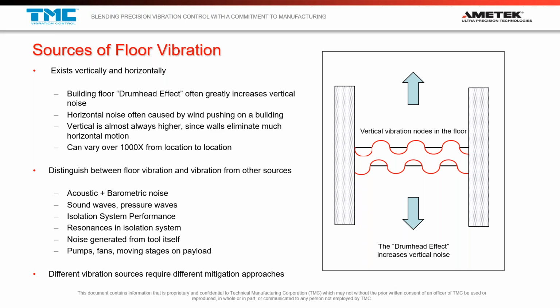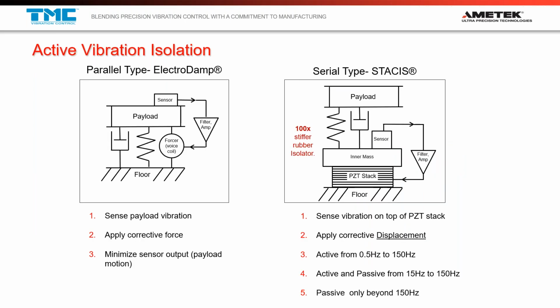So all of these things are different sources, but they all require different mitigation approaches. Today we're just going to focus on floor vibration cancellation, and then we're going to focus on active vibration cancellation, and specifically the use of piezoelectrics in active vibration cancellation systems.